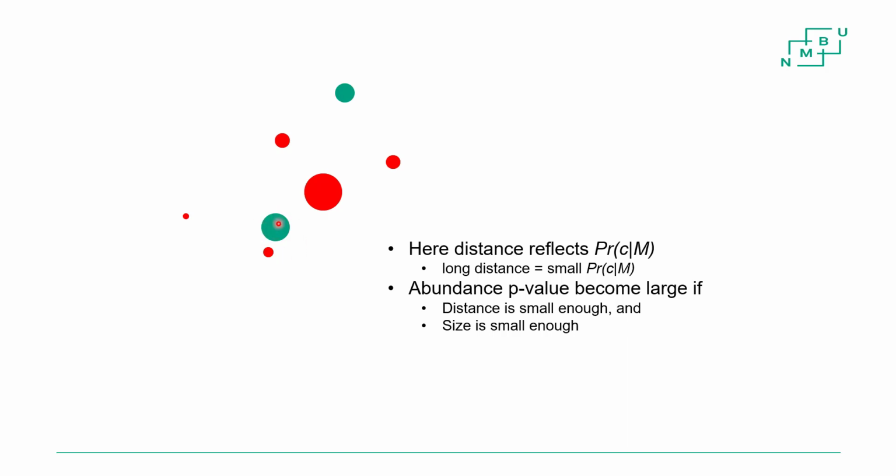It's too abundant, right? Even if the probability of this error is quite high, it's not that high. It's not almost the same abundance as the mother. I mean, errors don't occur that often. So that's why this one is not grouped together with this mother. Even if it's close, it has too high abundance.